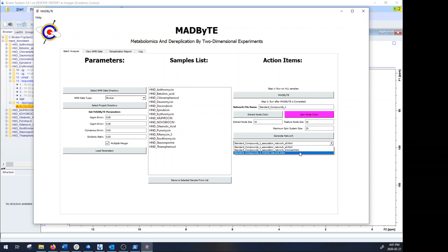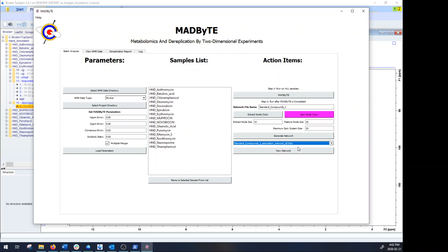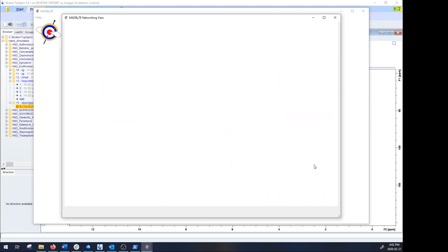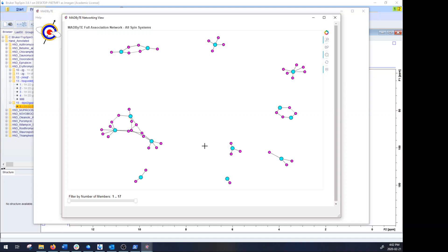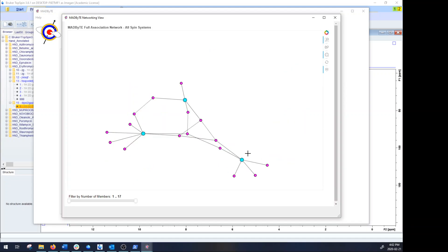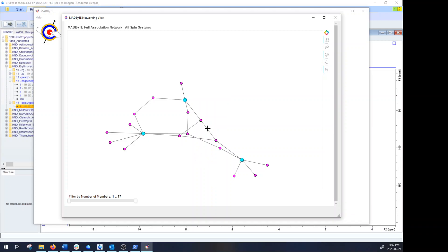So to take a look at the difference, the full association network or association network all, if we launch this it will pull up all of the different connections that we have seen. So for instance if we take a look at this cluster here we can see that we have three different macrolides, all of which share a lot of different structural characteristics in the main scaffold as well as some of the sugars.